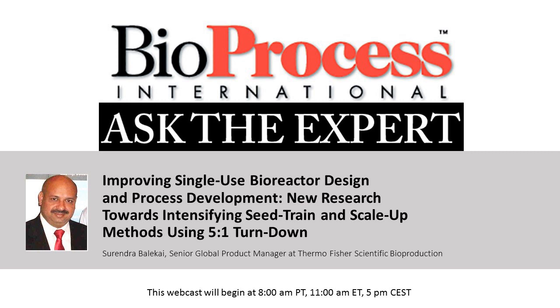Thank you, Leah. Good morning, good afternoon, and good evening, wherever you are in the world. Thank you very much for joining this scientific session on bioreactor design and its new concepts of 5-to-1 turn-down ratio, and how it helps in intensifying the seed train and scale-up aspects.